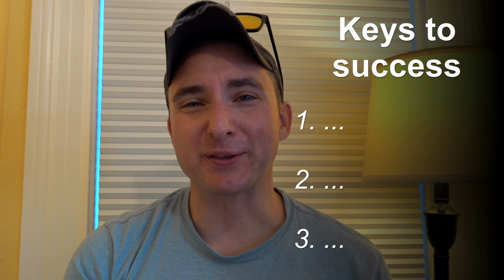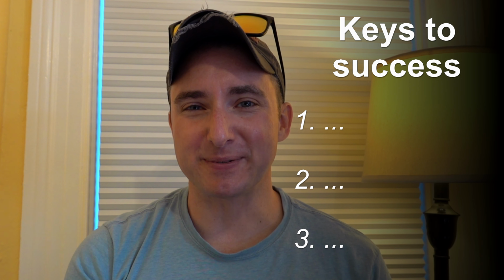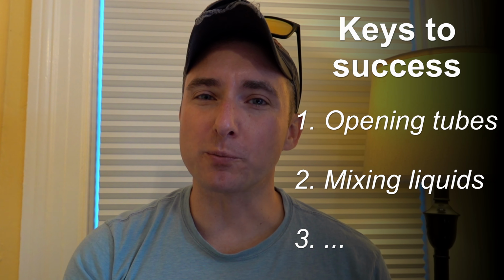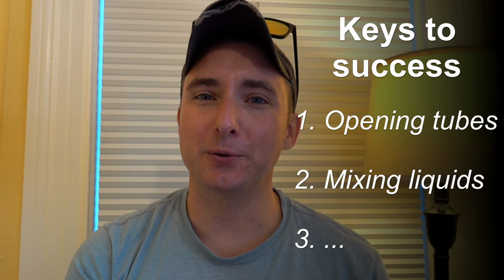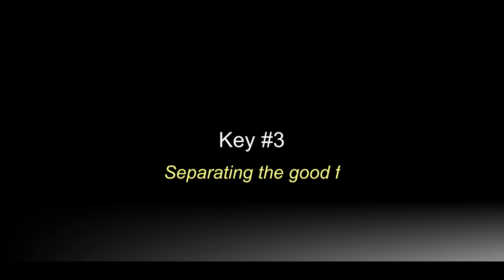So we're working through the 3 steps that I've seen over the years make the difference between a successful and a challenging crossover between a field and a lab scientist. And the most common mistakes have to do with the simple, basic techniques of opening and closing lids. The most underappreciated ones tend to be how important it is to mix samples correctly. Now we're reaching the most critical one.